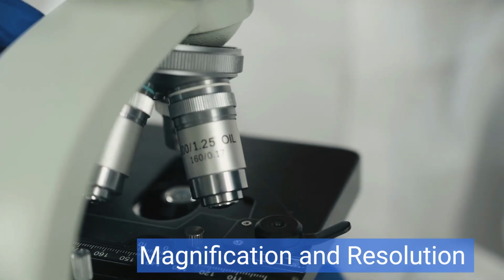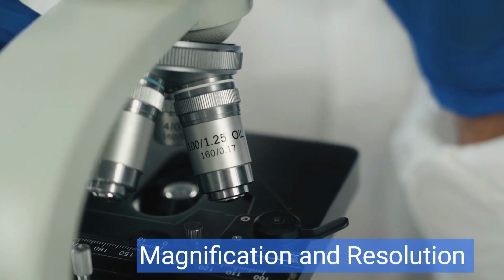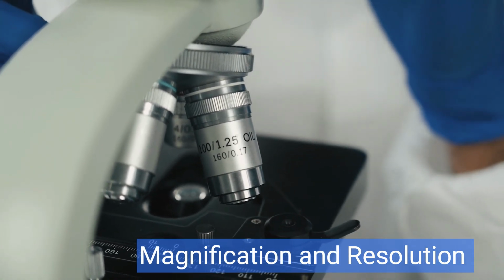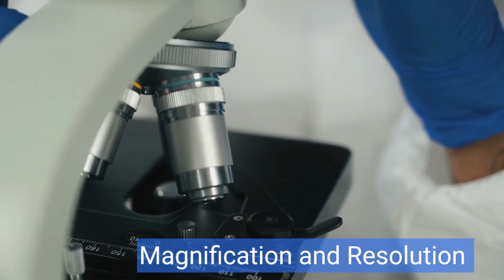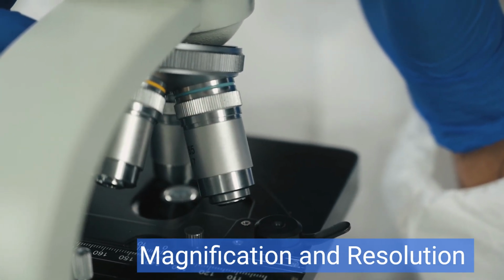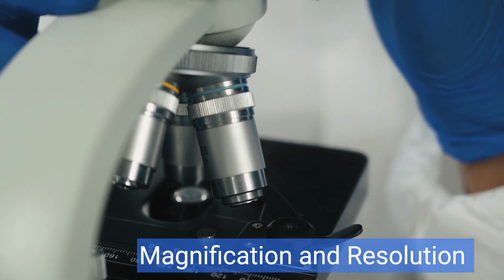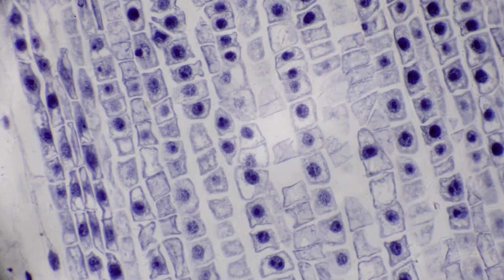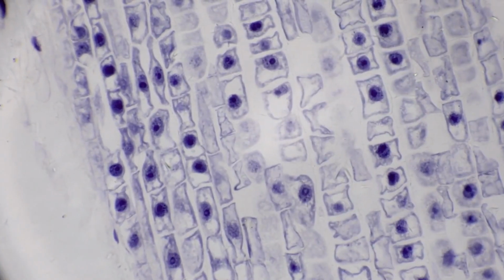Step 3. Magnification and resolution. Look for a microscope with appropriate magnification levels for your studies. Consider both the objective lens and eyepiece magnification. Higher magnification doesn't necessarily mean better, it should be suitable for your intended use. Also, pay attention to the microscope's resolution, which determines the level of detail you can see.